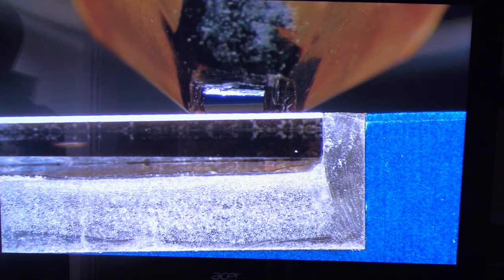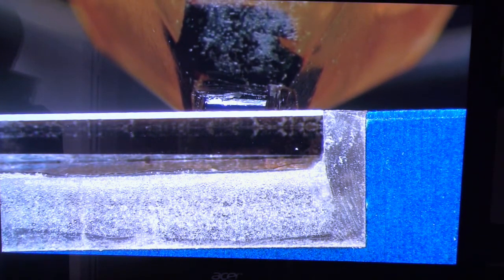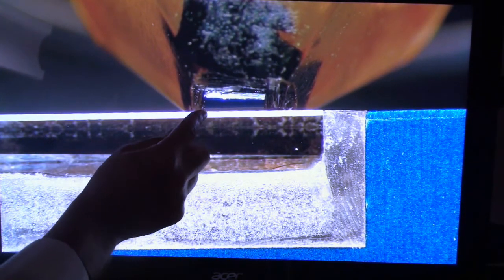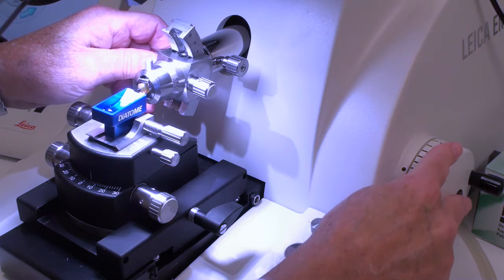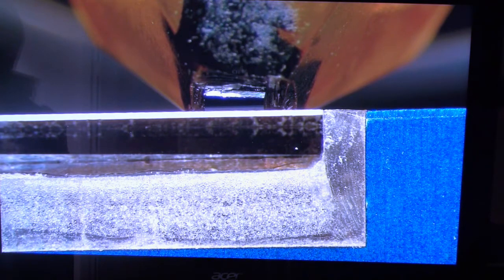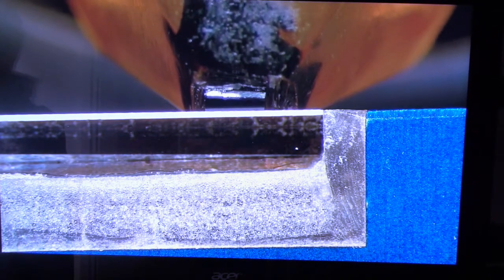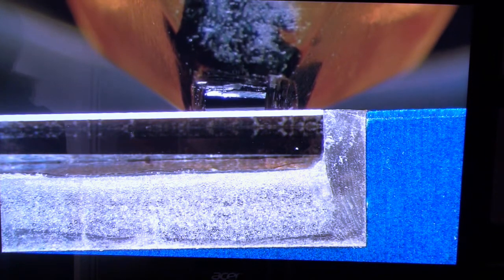So I'm going to change my specimen arc and rotate it so that the specimen's top is farther away than it was before. And as I change that you can see the reflection is going to change. And again we can see that reflection, the representation of the proximity of our knife edge to the block face. And as I move that down, notice how it's thick there. And as I move it down it gets thinner. And this is important. What we want to do is have that even all the way across and then also even in terms of the same thickness from top to bottom.